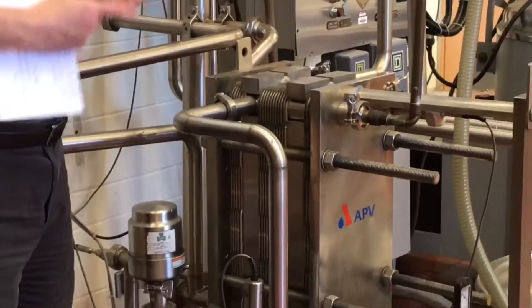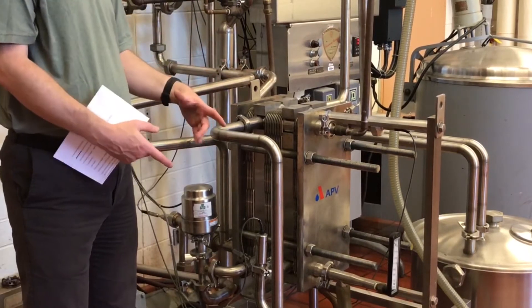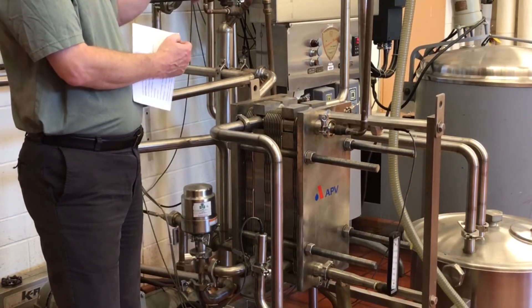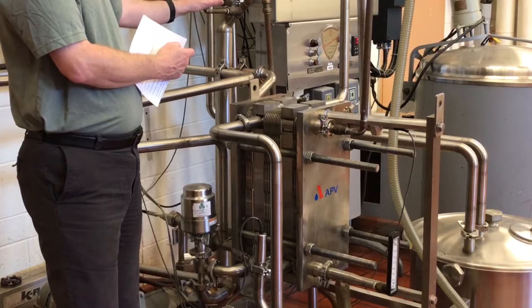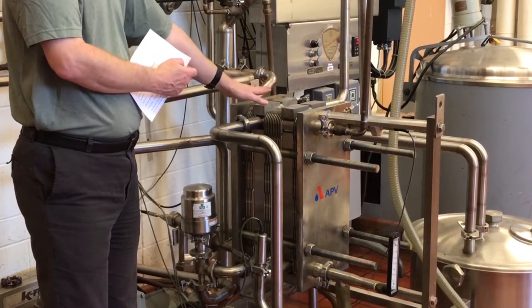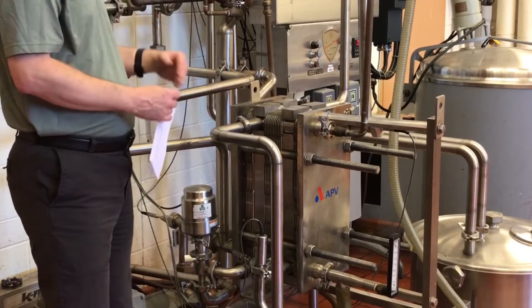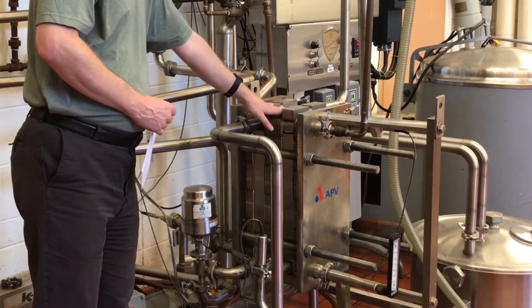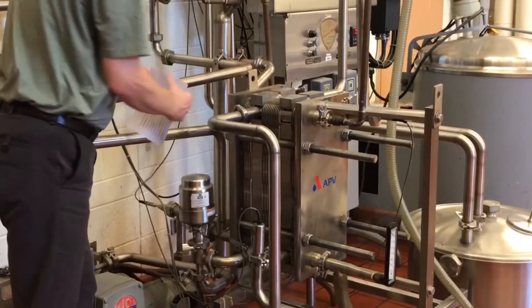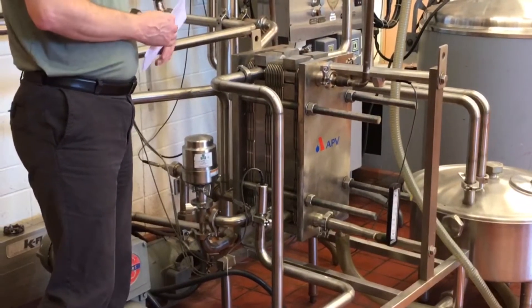The regeneration section has the biggest number of plates in the system and is where you usually get about 90% efficiency. We're utilizing the coolness of the raw milk to cool down the pasteurized milk, and the warm pasteurized milk transfers some of that heat to warm up the incoming cool raw milk. The regeneration section is where you get the most thermal efficiency, and our cold milk is gradually warmed up as it flows toward the back.